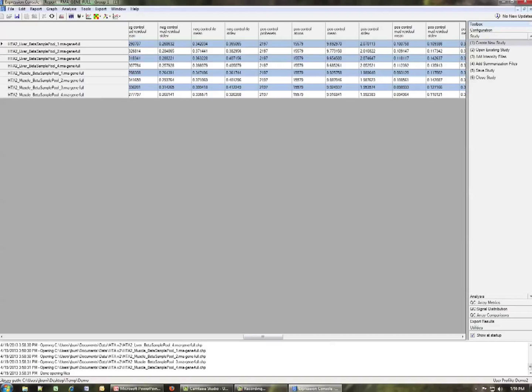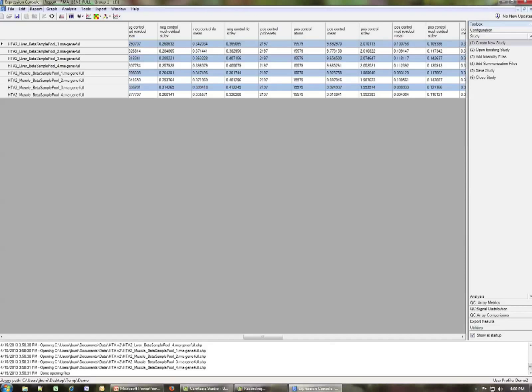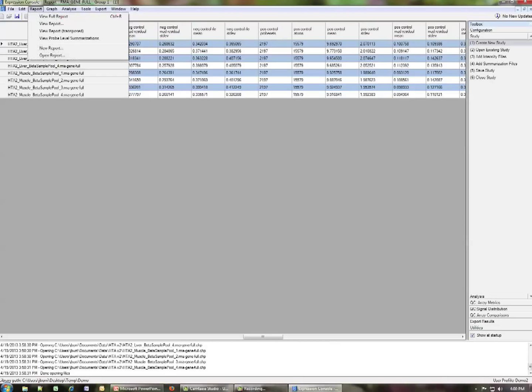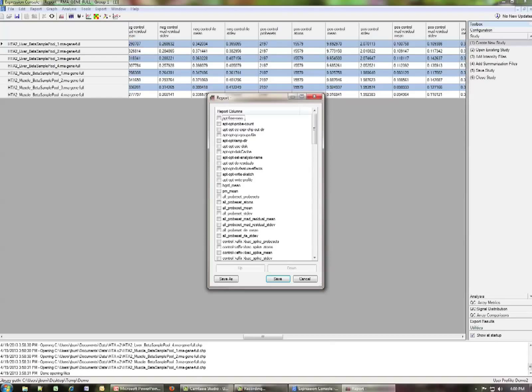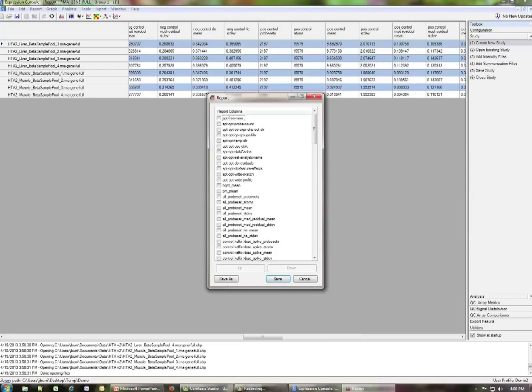Within Expression Console, you have the ability to tailor the reports in order to contain only the metrics that you're interested in. So how do you do this? If you go up to the report button on the top and click report and you click new report, you open this up and you'll be provided a list of all of the metrics associated with the chip file or the results files that you have loaded. And now from this list, you can select using the boxes on the left which individual metrics you want to have in a report and which ones you don't.